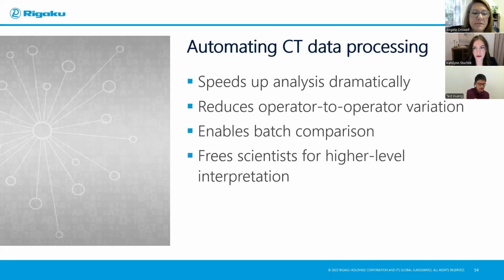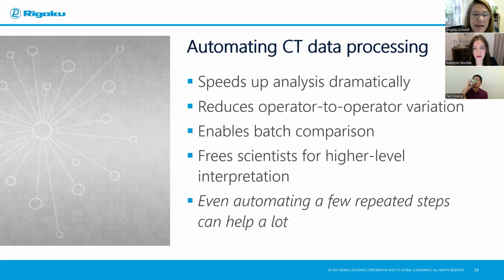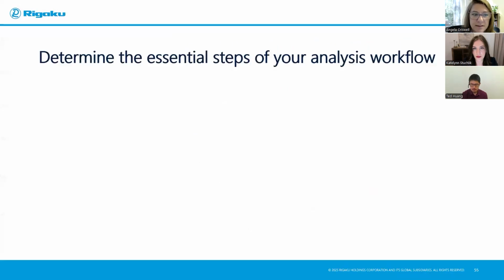And of course, it's going to free you to do other types of interpretation. And also, I would just argue that even if you automate a few steps of your process, that can help a lot. And processing, keep in mind, can sometimes be the most time-consuming part of your time spent with these scans. So try to automate at least some of these manual tasks.